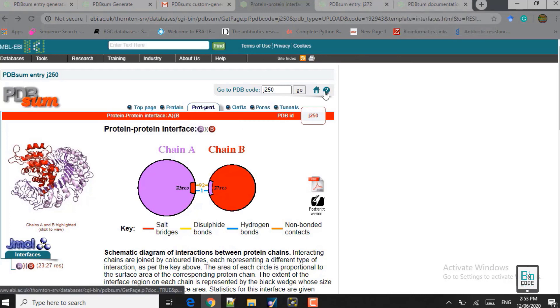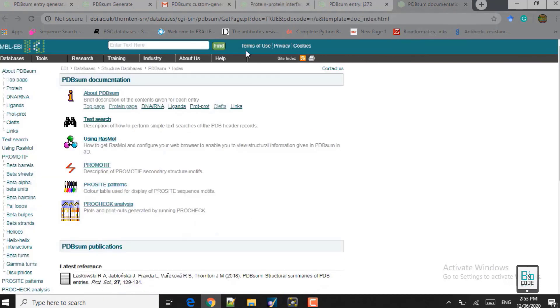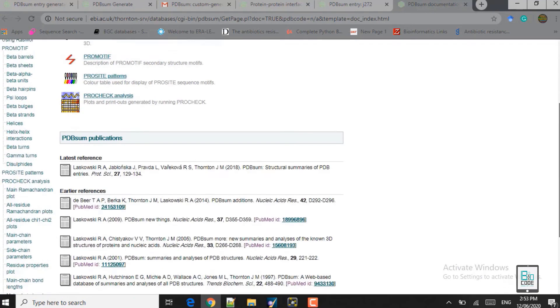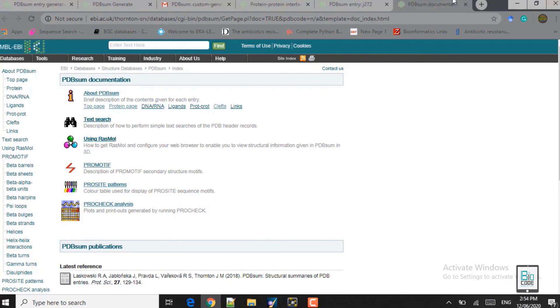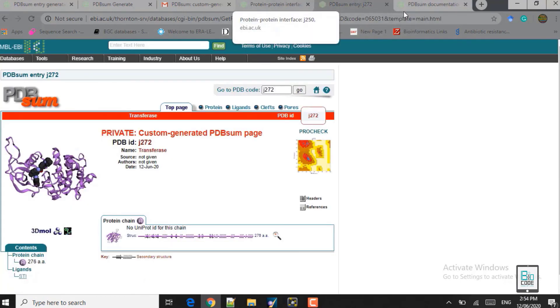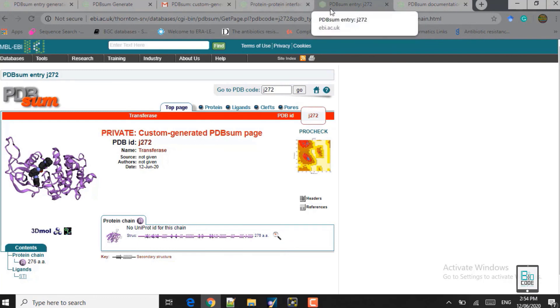You can click on the question mark if you want any detail regarding PDBsum — its input file, output file, and so on. Here you can see the top page, the protein section, the DNA section, the ligands, and the protein-protein interaction that we talked about. More tips and everything are available under that question mark. The next thing is that I uploaded the next complex — which we will cover next.